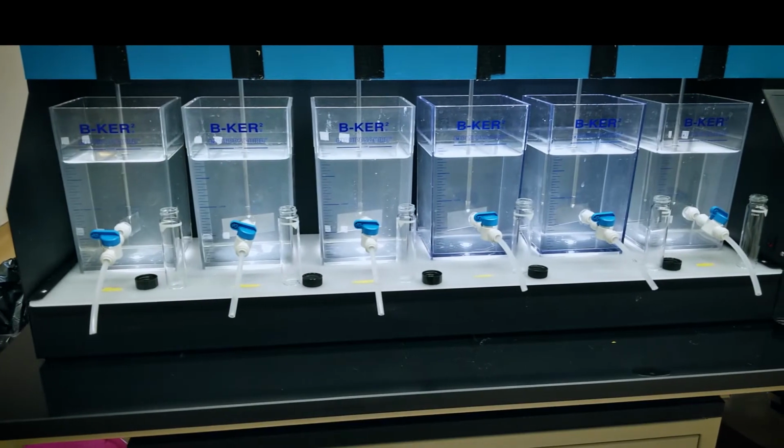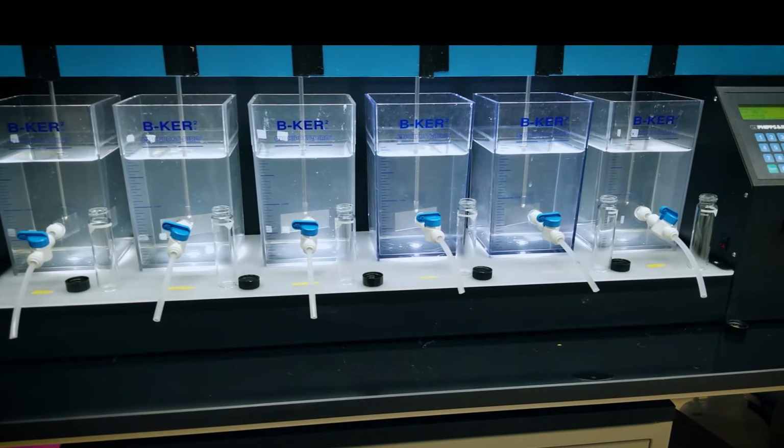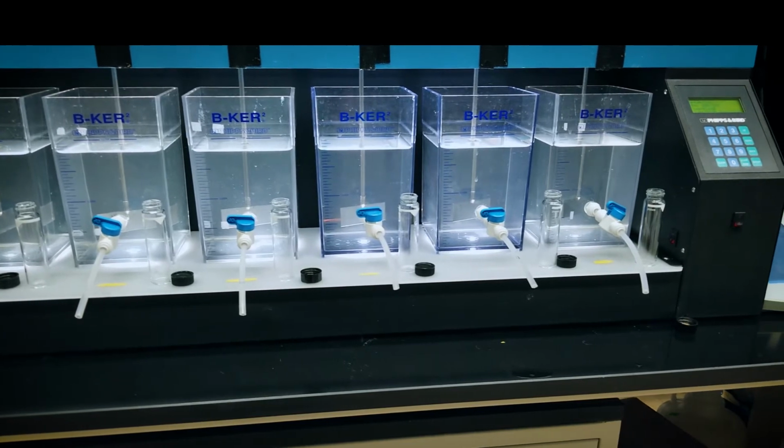Jar testing is the go-to trial and error method for optimizing coagulation in a drinking water treatment plant. Unfortunately, jar testing doesn't work at every water treatment facility. Some water treatment facilities produce a charge neutralized floc that is not large and settleable, such that the jar testing method would indicate that sedimentation doesn't work and that the coagulation process was ineffective. When in actuality, the coagulation process worked and the water would filter and produce low filtered water turbidity and meet all regulations.